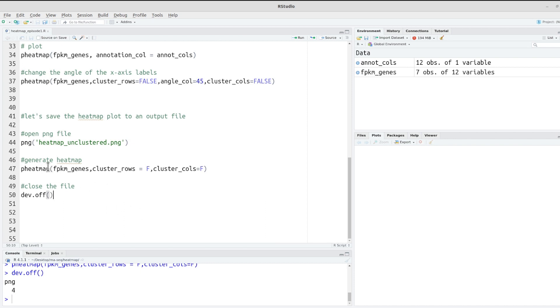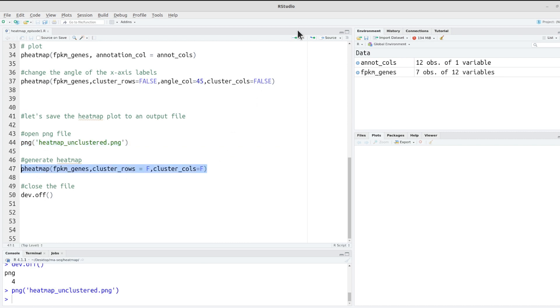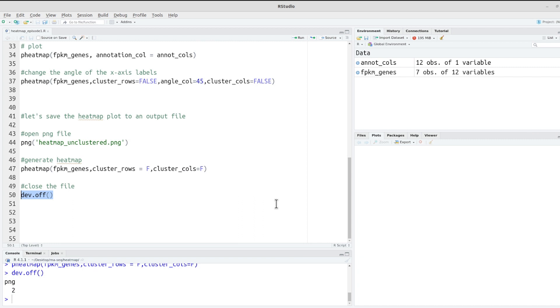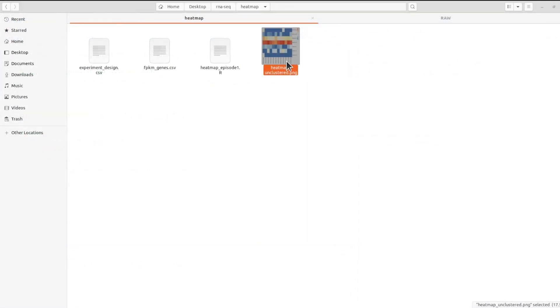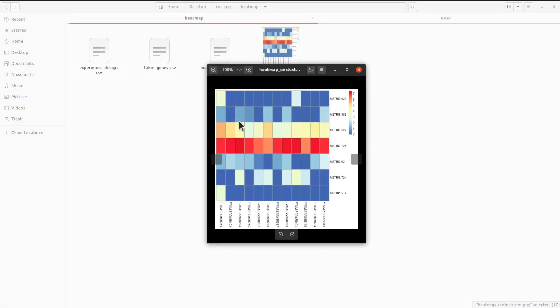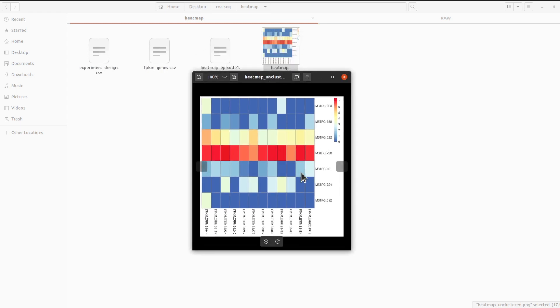Sometimes when you generate the plot and save it to an output file it may not appear, so if that happens just repeat the pheatmap code again. Once you have the file, open it with your image viewer to explore it. This is how we use the pheatmap package to generate heatmaps when analyzing gene expression data.